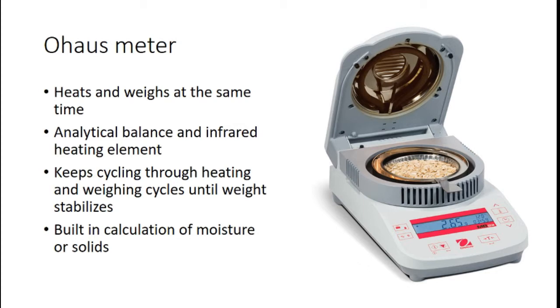And so it's very convenient if you have one-off samples that need to be done. Otherwise, you need to have a bank of these. Again, if I had to do it with those 200 samples at the government lab where I was doing flour testing, I would have needed a whole bank of these. And these are convenient devices, but they are several $1,000s Canadian or American to purchase. The nice thing too, the math can be automatically done for you, and so this can become like a black box technology for a minimally trained worker to be able to perform.